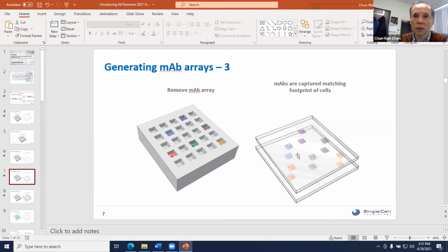And sometimes we'll see, wait a minute, this particular sequence is present on both of them, but only one of them is positive. Then we look very closely at that particular spot. Sometimes it's very, very weak, and when you go through your image analysis, sometimes you miss that. Or sometimes there's absolutely no signal, and what we found is that it's the sequence differences.